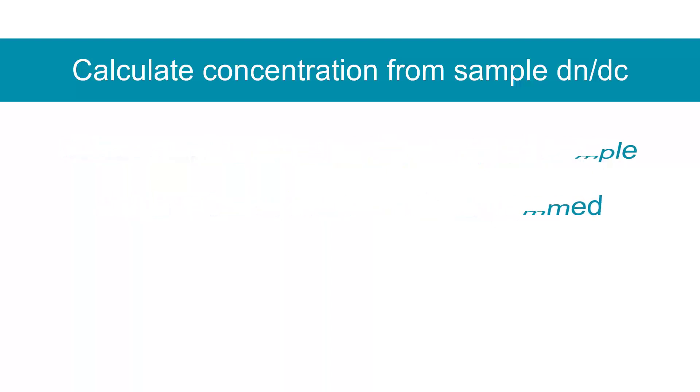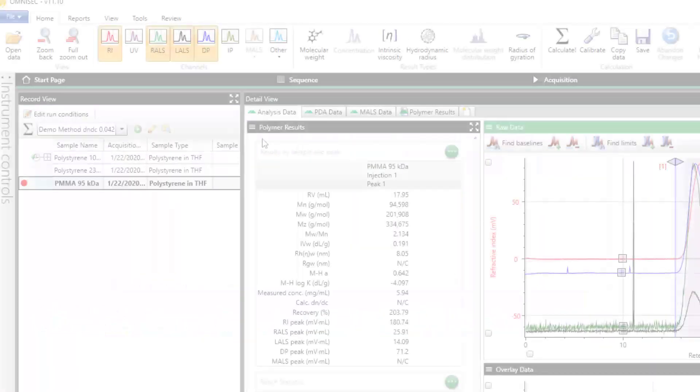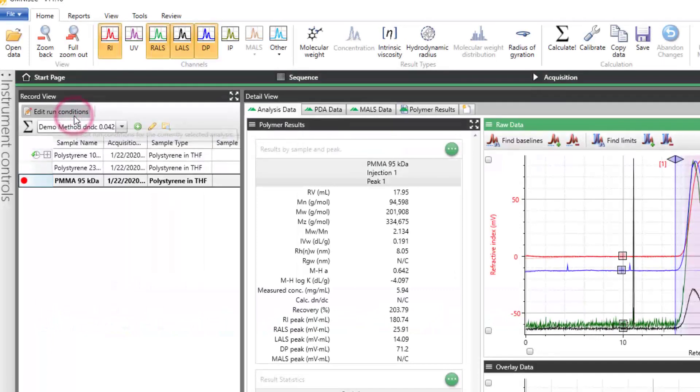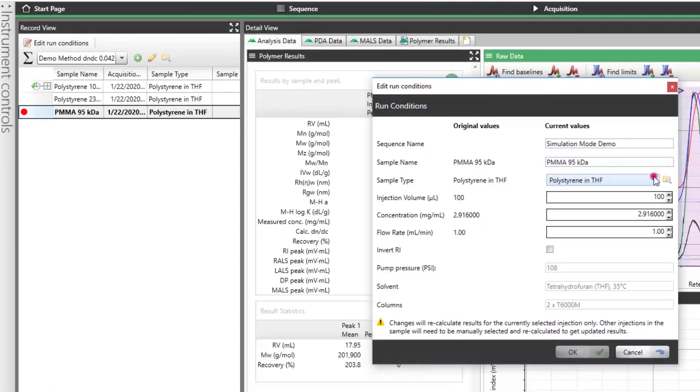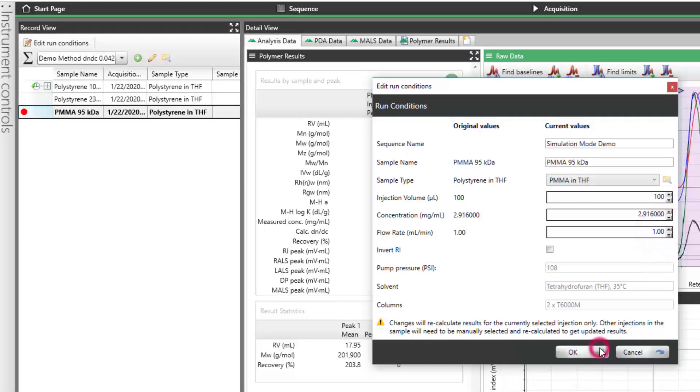What differentiates this method type from the next one is that multiple sample types, each with different DNDC values, can be analyzed using the same method. If the sample type DNDC needs to be changed after the data has been acquired, that can be done by clicking Edit Run Conditions and selecting the correct sample type.